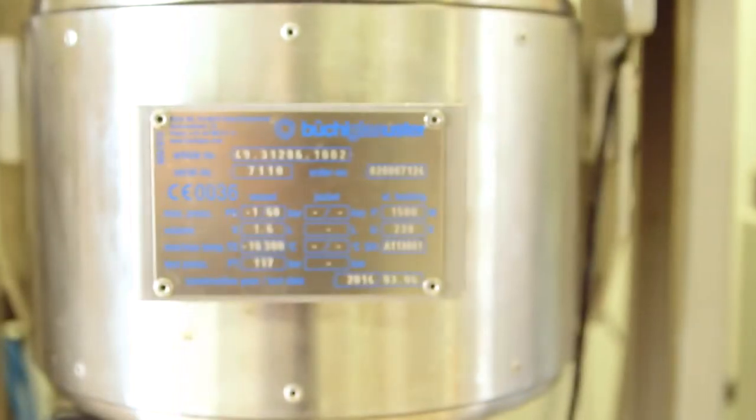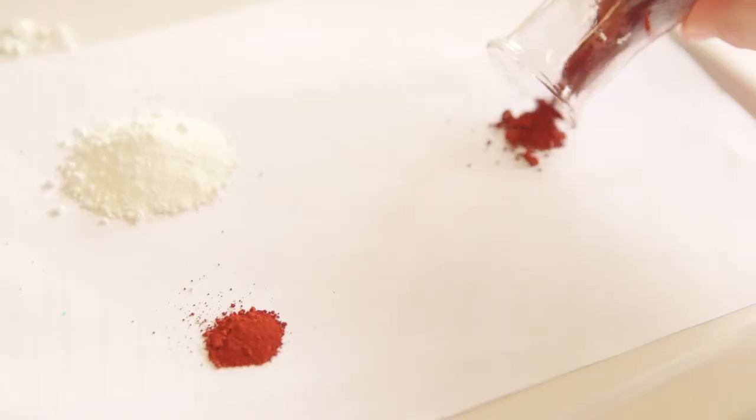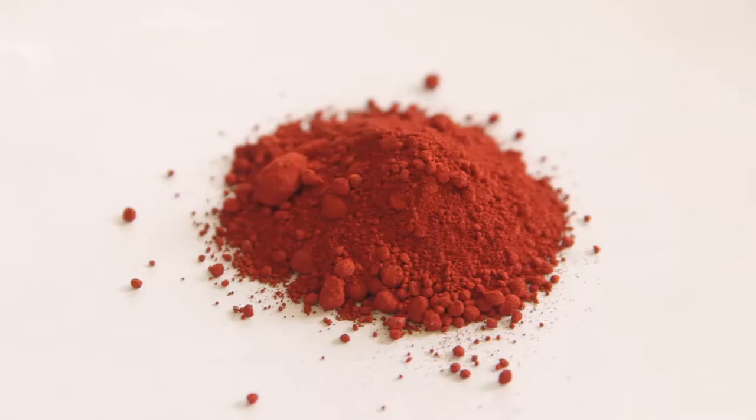With the volume of 1.5 liters, this reactor is ideal for the production of a large amount of nanoparticulate material. As an example, it is currently used for the production of color pigments.